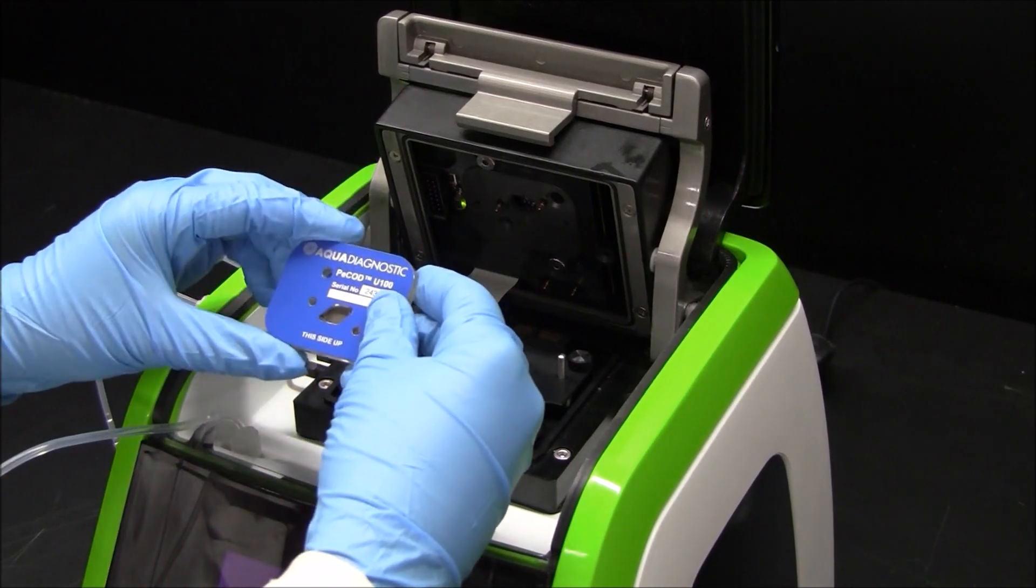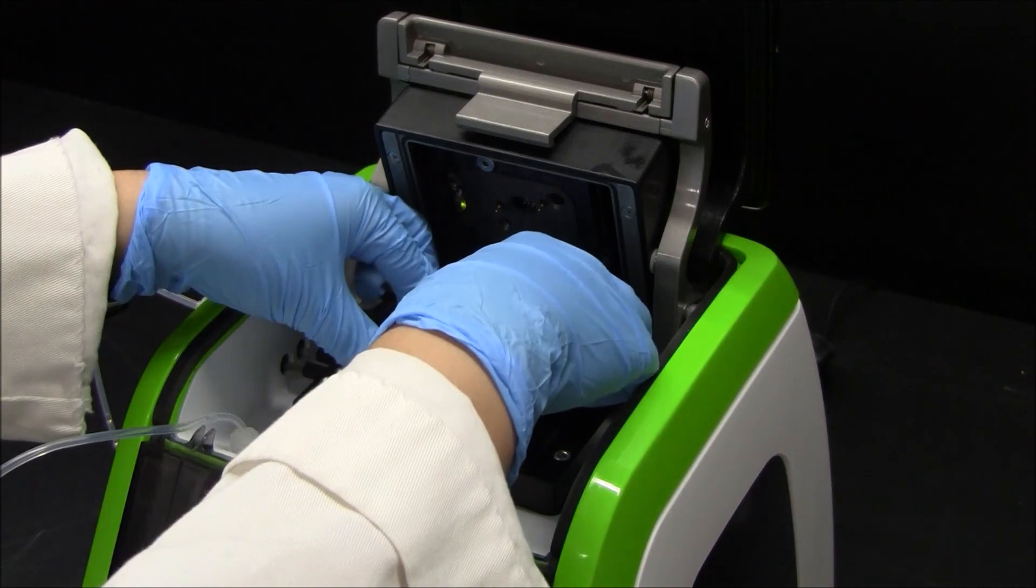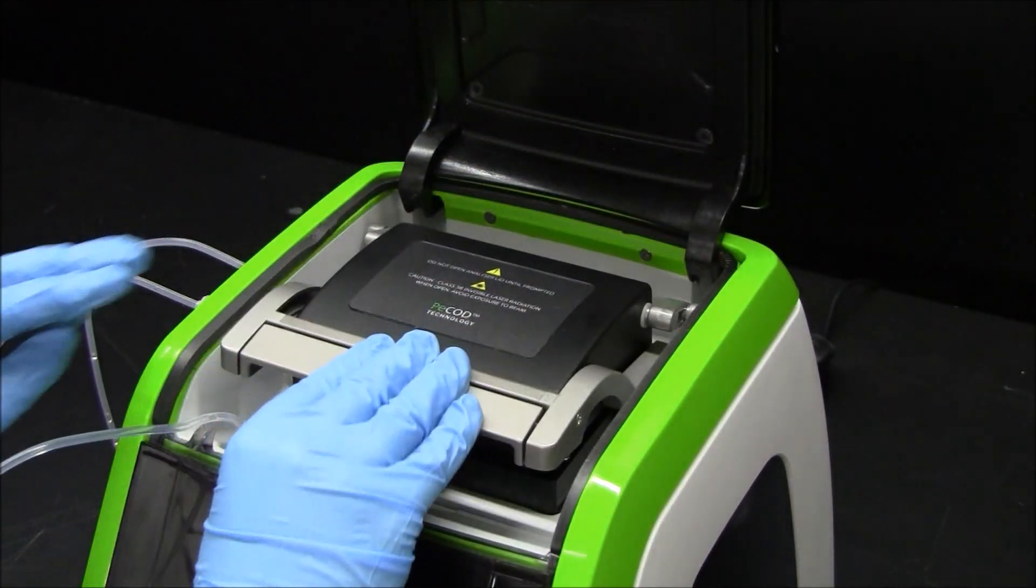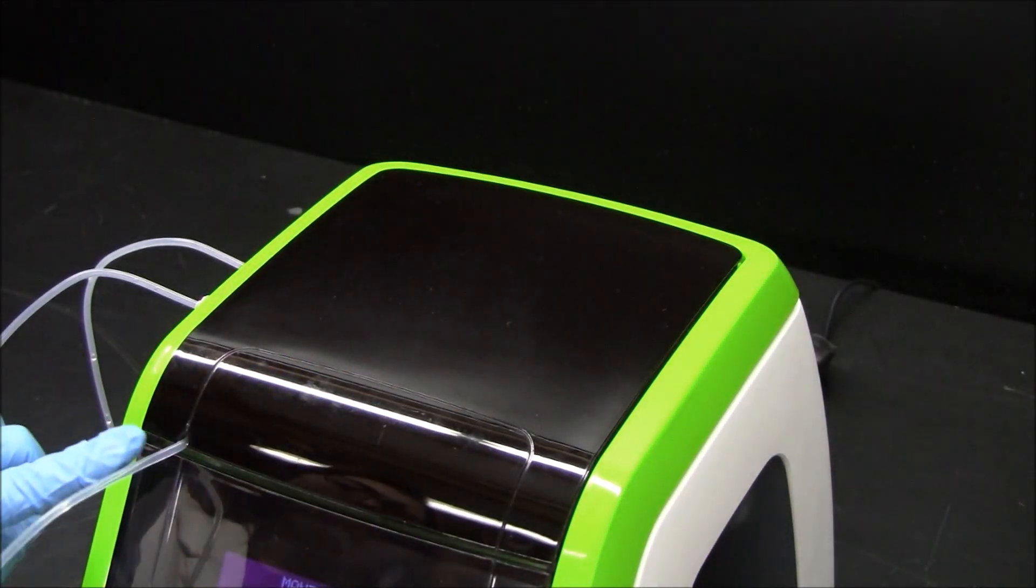Check that the blue sensor is the correct side up. Match the holes in the sensor to the pins of the electrode block. Close the analyzer head with some pressure. Place the port A tubing through the guide to prevent pinching.